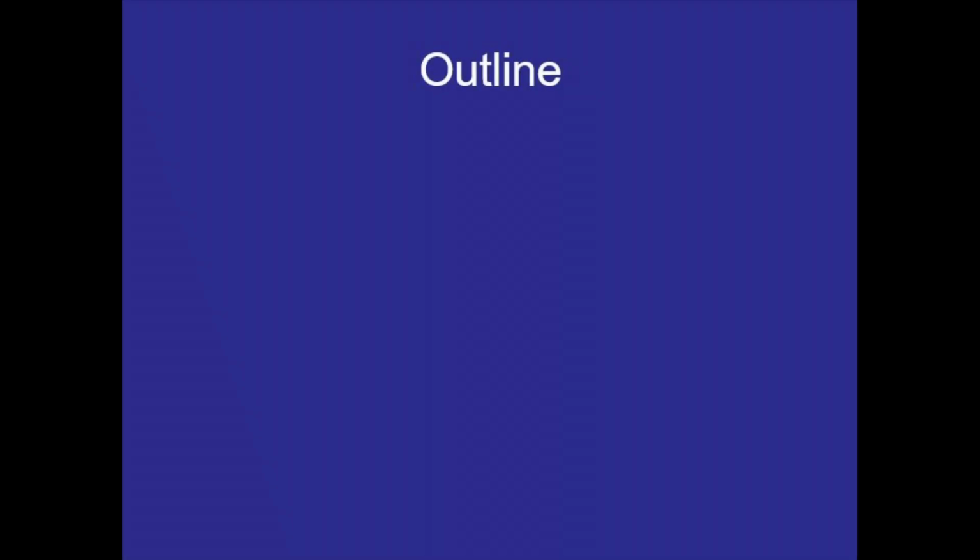Hey everybody, this is the Friedel Acetylation Lab. Here's the outline for this video. I'll be going over the reaction, some of the reaction conditions, and the procedure in general. Then I'll be going over some of the properties of the molecules we'll be using or producing.